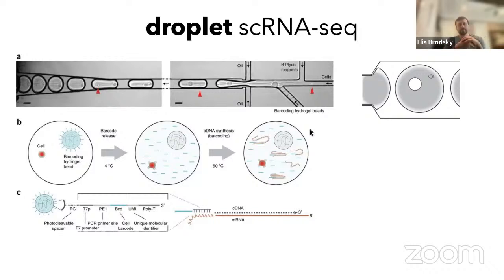And at the end, you have this ability to separate your reads into individual cells, right? And this is the technology that is going to be used most often today when you encounter single cell data. For example, 10x Genomics is going to be utilizing something like this.